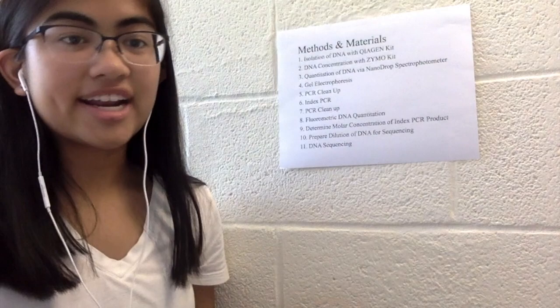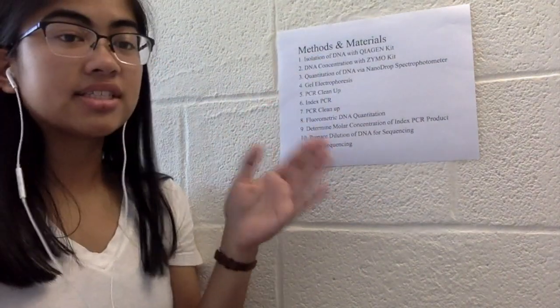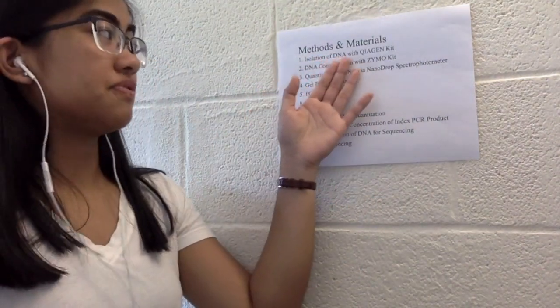In this experiment, we are testing to see the similarities and differences in the gut microbiome of a herbivore and a carnivore. Our hypothesis is the bacteria will vary between a herbivore and a carnivore due to the difference in their diet. The animals we are comparing are a 2-year-old iguana, which is our herbivore, and a 2-year-old snake, which is our carnivore.